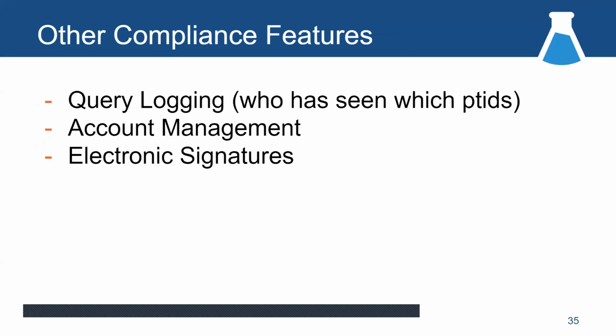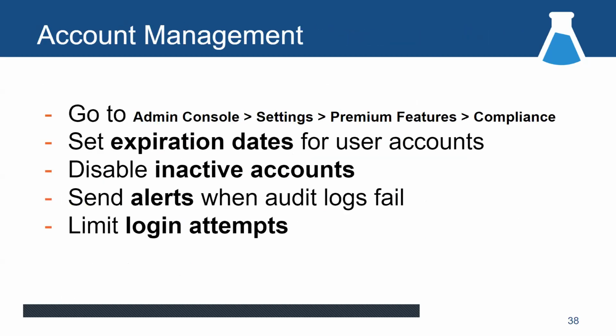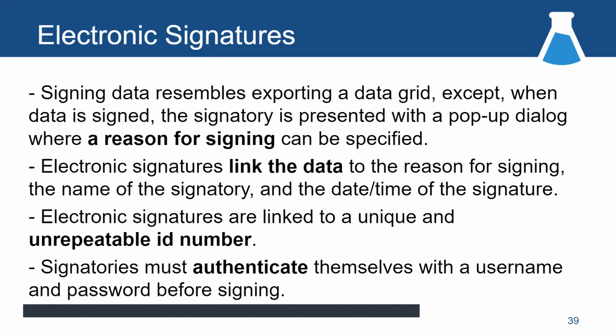It also will allow you to do much stricter account management. So you can tell the server, I want this person's account on my server to last only a few days, or to expire after a few days, or to expire after they've been inactive for a few times, etc. It also lets you limit login attempts. You can also do electronic signatures on your data as part of compliance. And so that's just a few of the things we didn't look at.